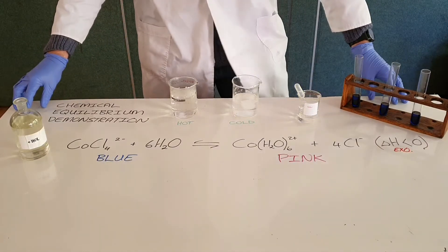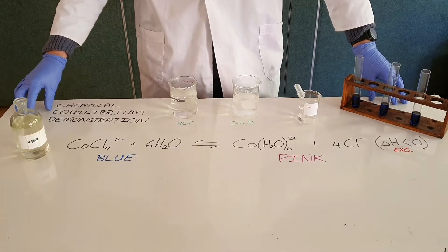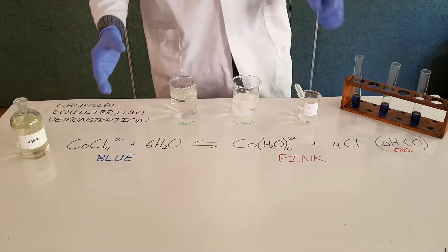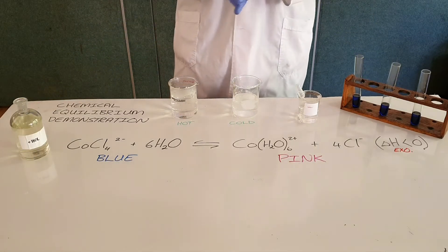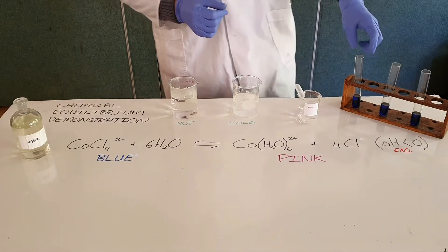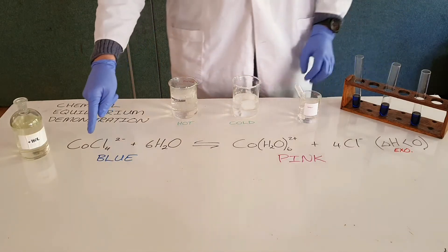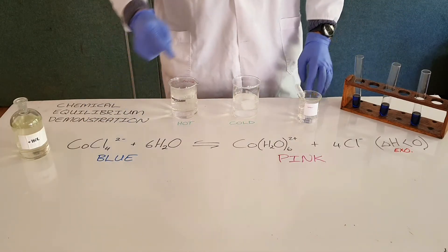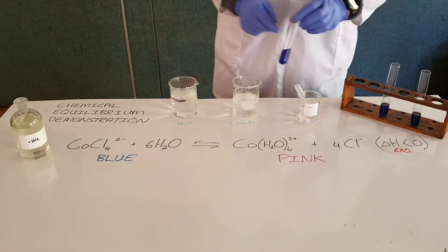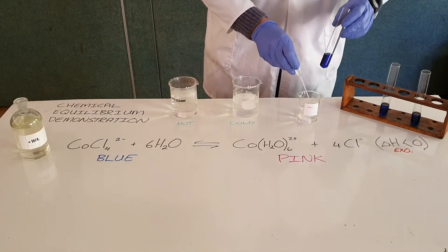We can demonstrate the way in which Le Chatelier's principle governs chemical equilibrium by making changes to a reaction and seeing how that solution changes accordingly. The reaction we're working with here is cobalt chloride reacting with water. Here we have cobalt chloride — you can see that it is this dark blue-purple color.